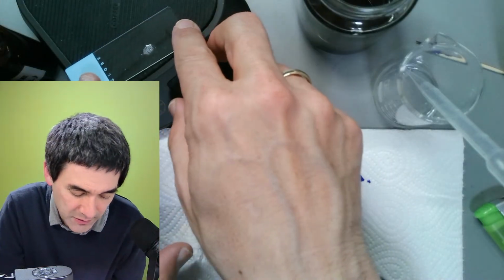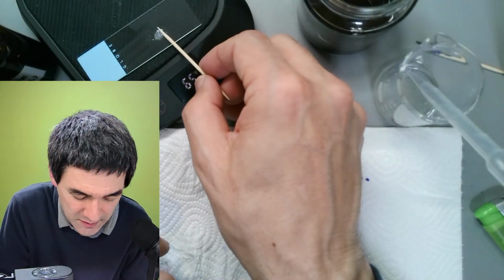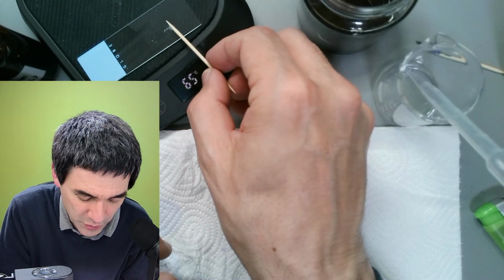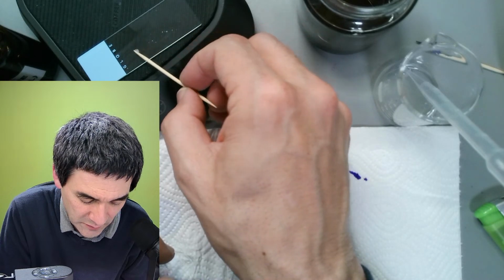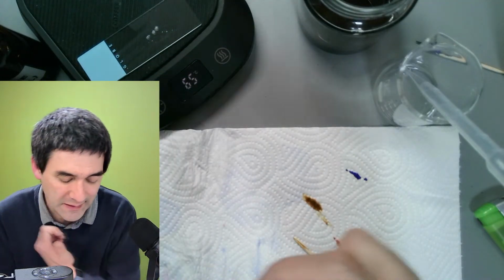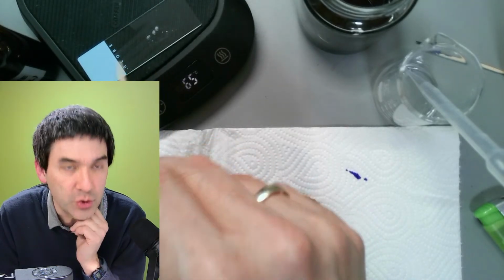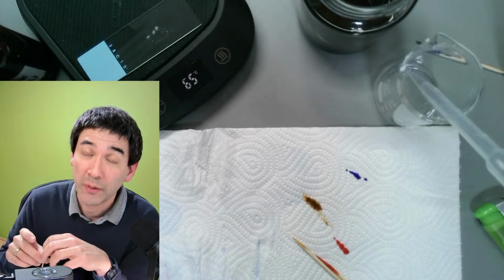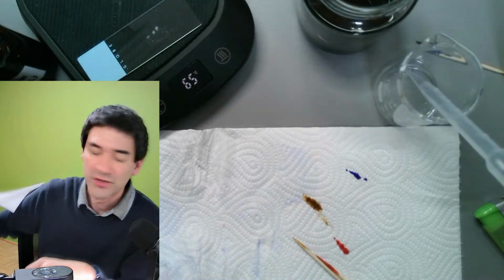So that's a little bit the question: how quickly is this able to dry? Let me spread this carefully here as well, to give it a little more surface area. If you give it more surface area, then it might dry a little bit faster. But then again, I don't know. We're going to see. What we could try to do is just stain it with crystal violet, because in this case they're definitely going to stain blue, whether they're gram-positive or gram-negative. Some comments and questions are here again, which I'm going to go through in a minute or so.